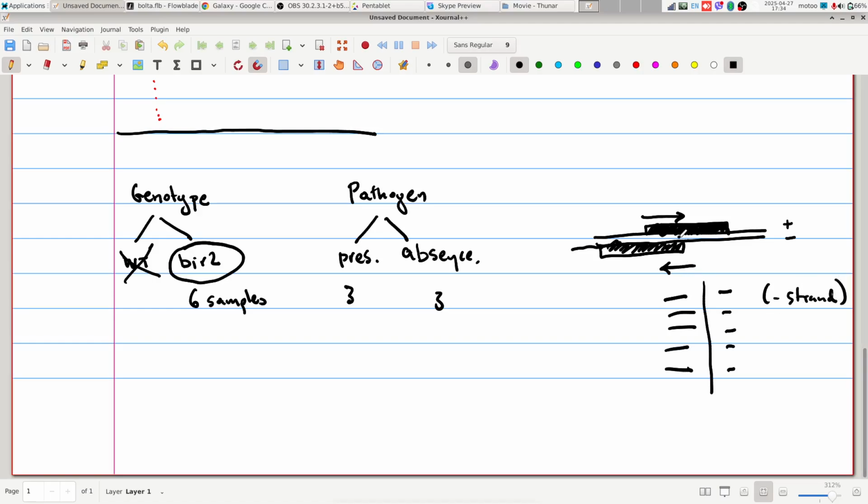If we say that this is unstranded, then the program will not know whether to assign it to this gene or to this gene, and therefore it rejects them. If we say, however, that this comes from the reverse strand, from the other strand, it means that if these reads map here on this plus strand, then I will assign it to this gene that comes from here.